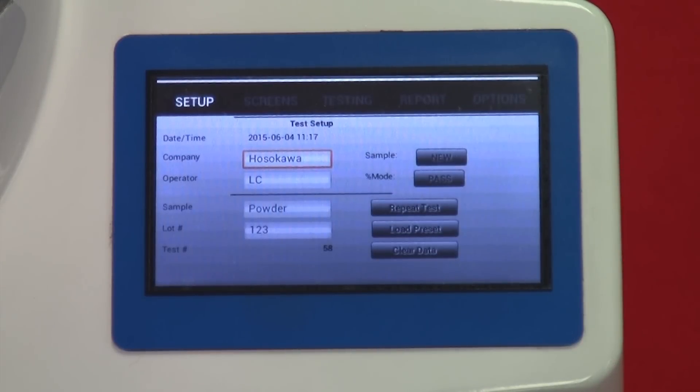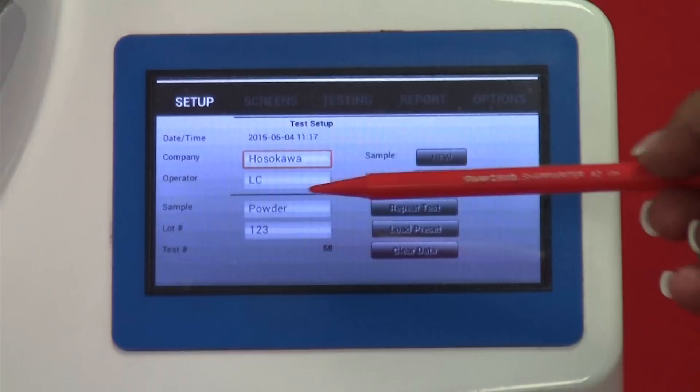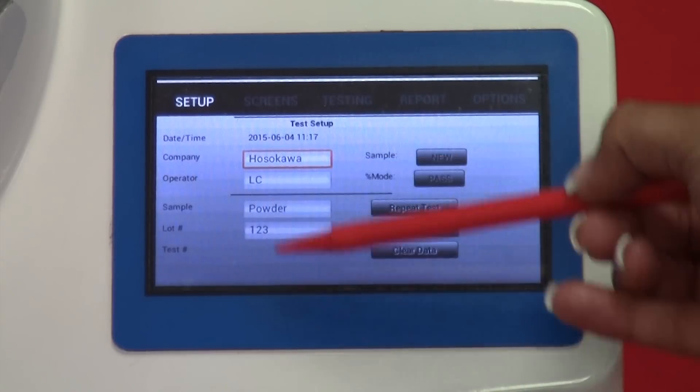After the info windows, the setup screen is displayed. It lists the company, operator, sample, lot number, test number, and date and time. These cells are shaded gray, meaning the information cannot be changed until the operator presses one of three buttons: Repeat Test, to repeat the previous test and modify information; Load Preset, to load a previously saved test; or Clear Data, to wipe the cells and enter new information.